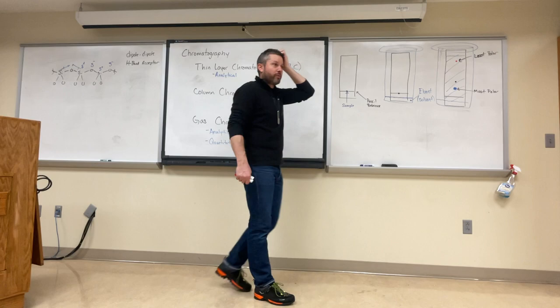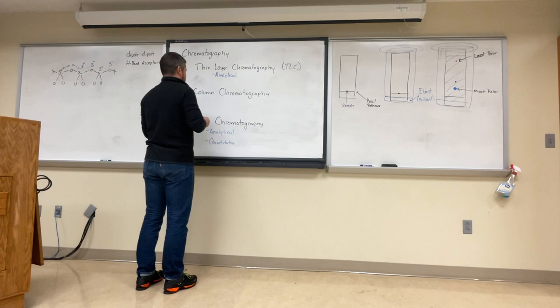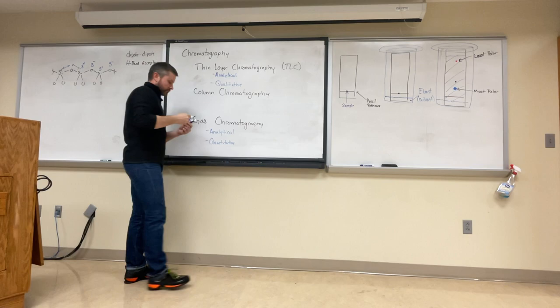Is it safe to say that TLC is analytical but not quantitative? Yes. Right, we would say that it's analytical and qualitative. But it's really easy to do.